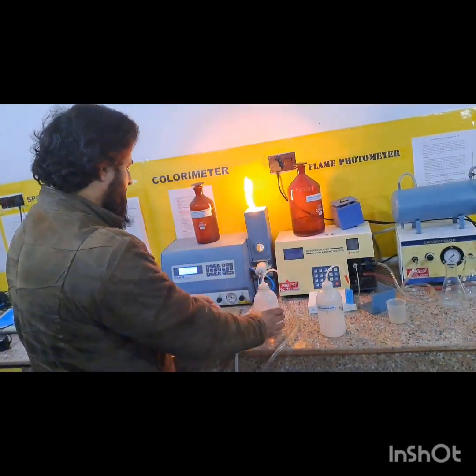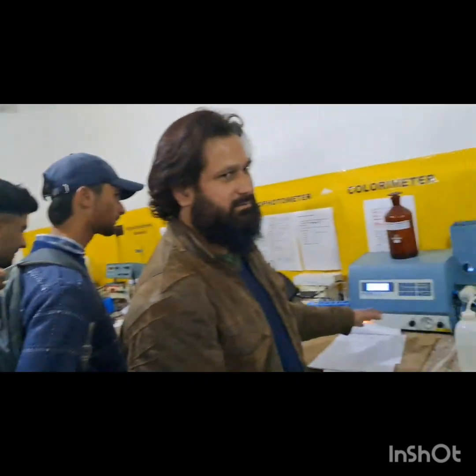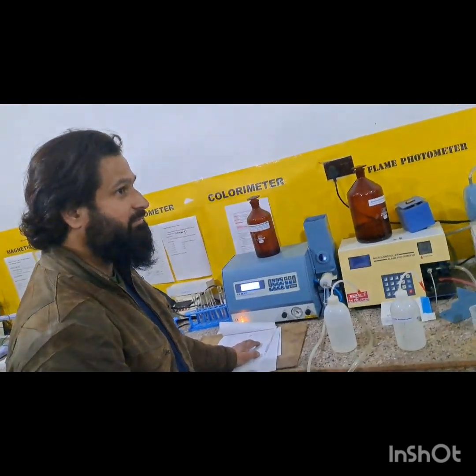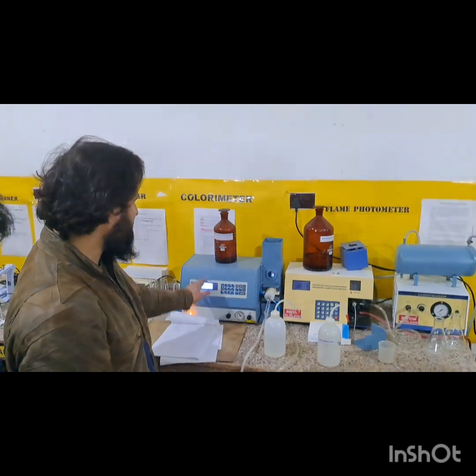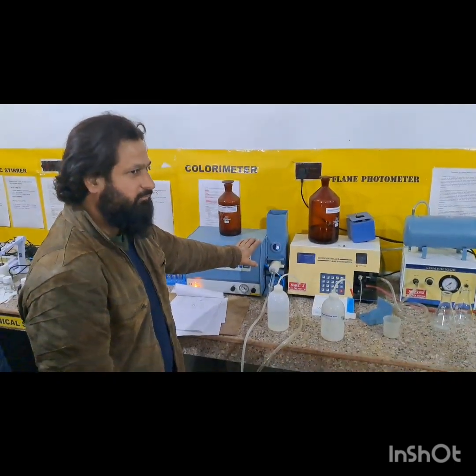4. Understanding soil health reports. Dr. Inam discussed how the soil testing lab provides customized recommendations based on soil test reports, covering aspects like fertilizer application and crop selection. The students saw sample reports and learned how the results could help farmers make informed decisions.